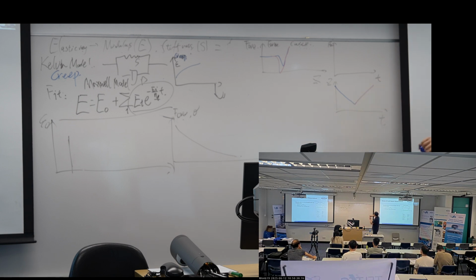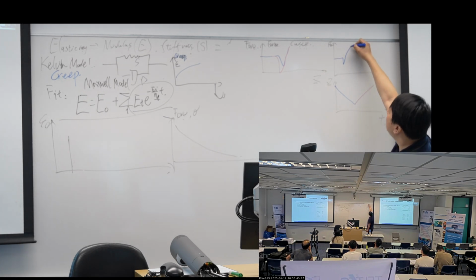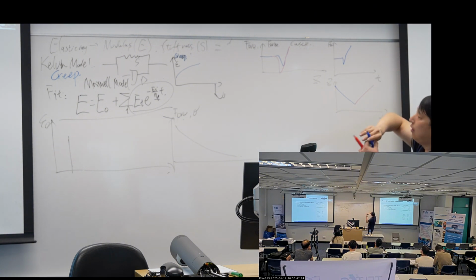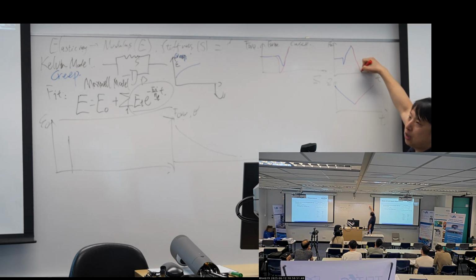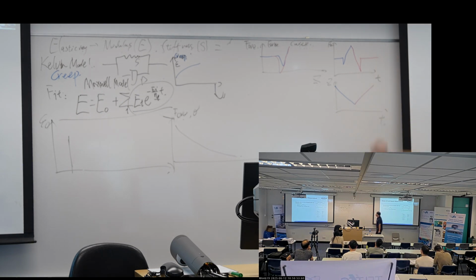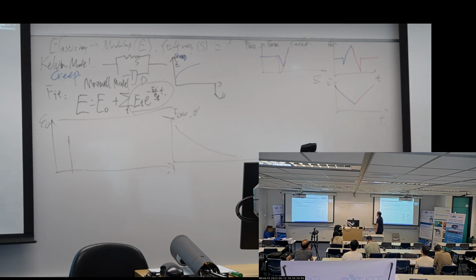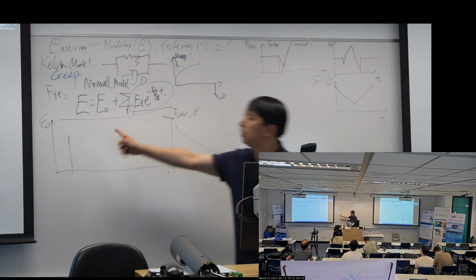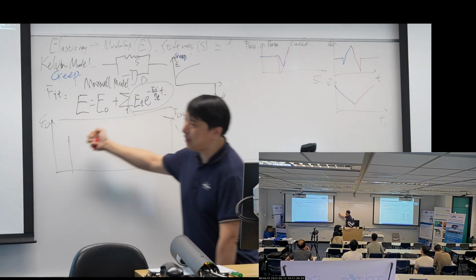And for the force, I have a baseline and an attraction force. I reach the maximum force, and then I drag out. I have the adhesion force and out. That's the force curves, the force Z against time. And then let's think about the creep. I'm sorry, relaxation. I need to hold my deformation.